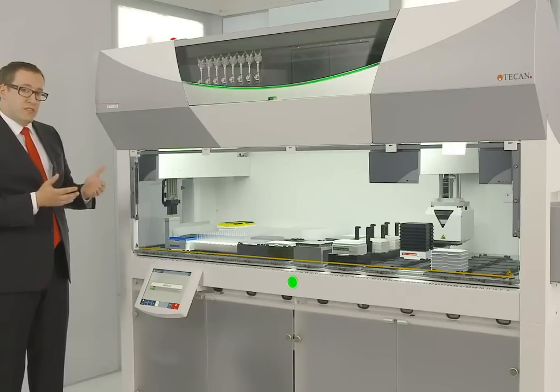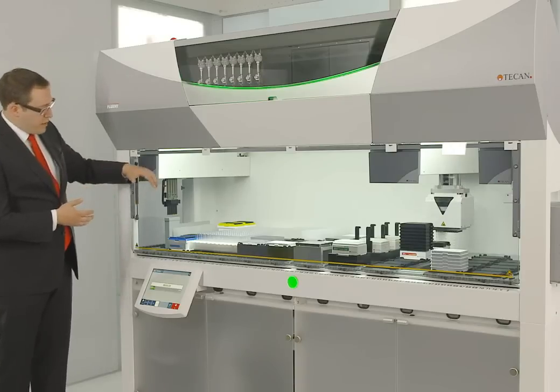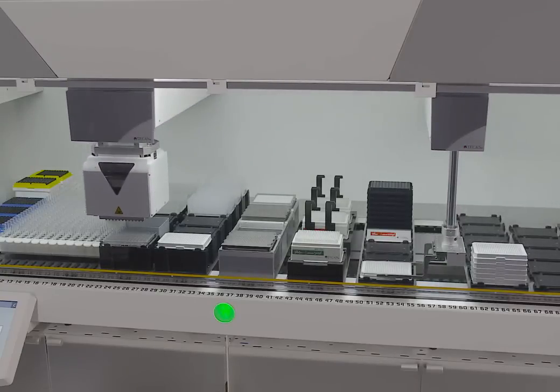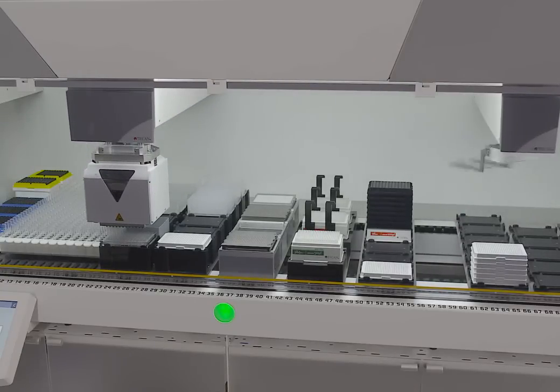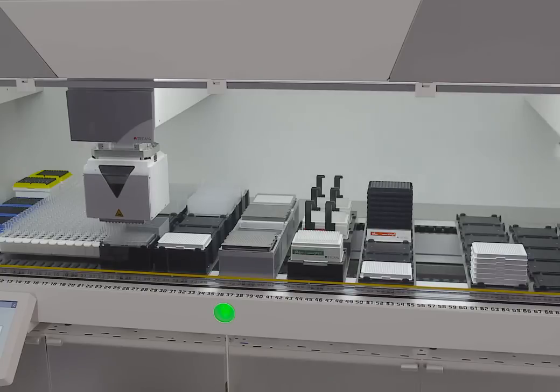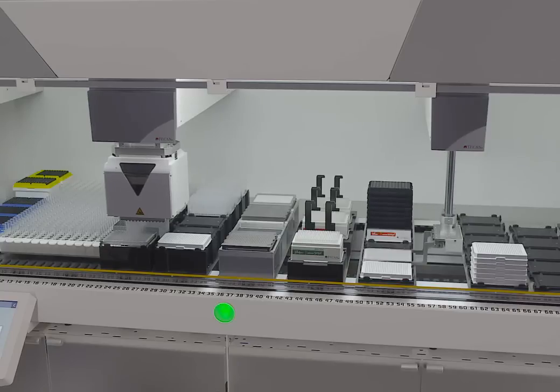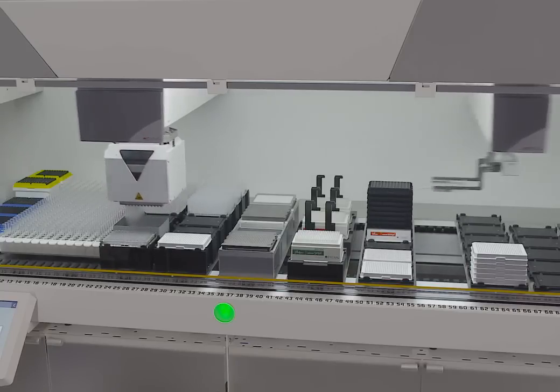And with these 32 tips, we will aspirate from the same plate that we started with. So we pipetted 32 tubes into the first 32 wells of the plate. And with these 32 tips, I will aspirate from those wells and dispense replicates into the other 2/3 of the plate. At the same time, you'll notice that the robotic gripper arm is continuing to take plates out of the hotel and take the lids off and put the lids back in the hotel. This is, of course, setting up for the next little step.